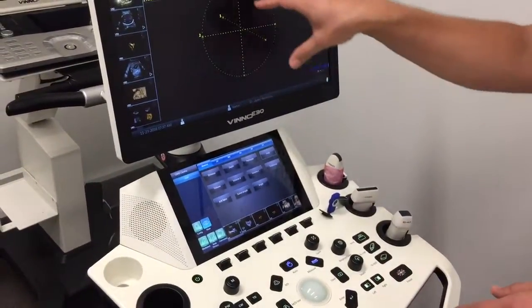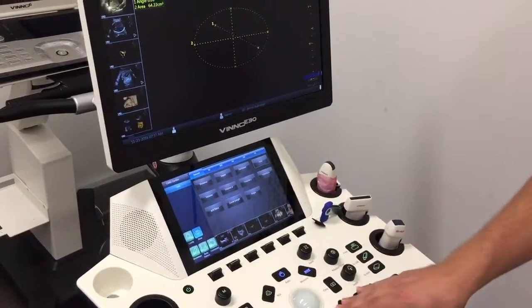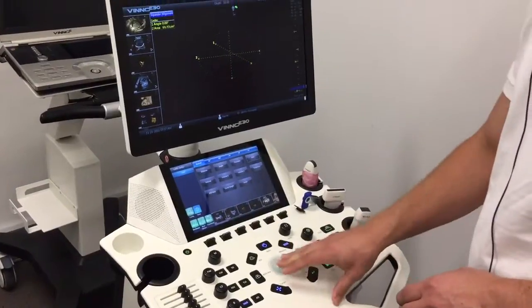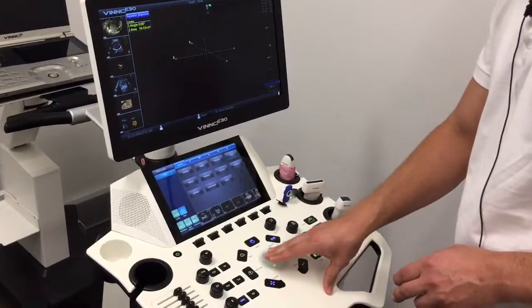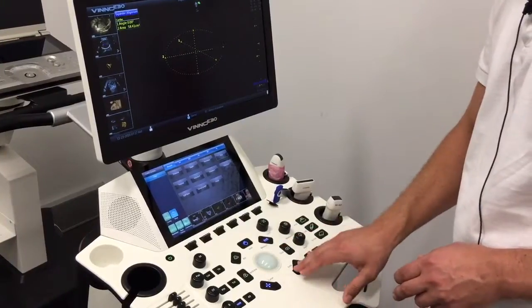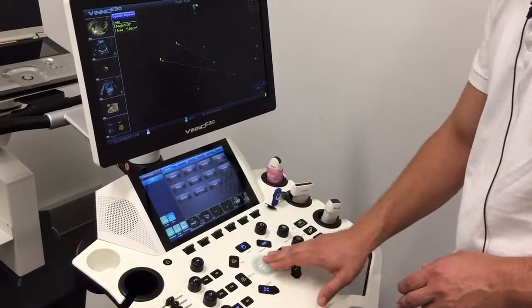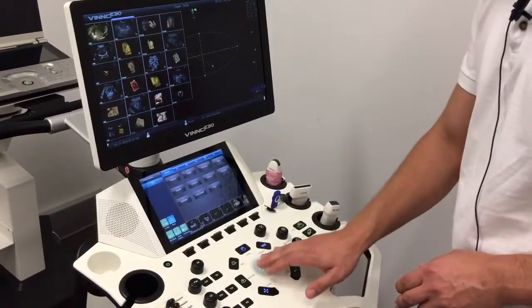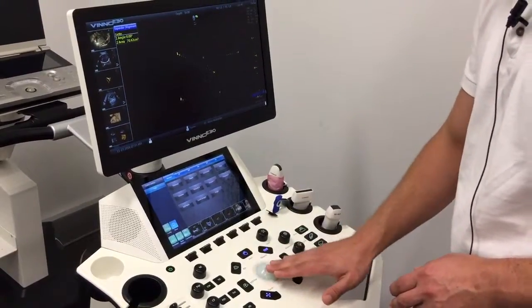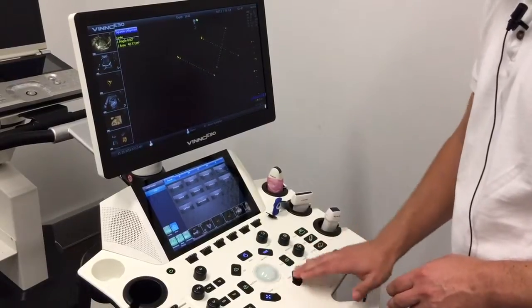For your ellipse, if you decide that you measure your ellipse here, for example, and then you want to move that ellipse around, it's doable by double clicking on the little crosshairs on each side of the ellipse. So you can spin around side to side if you've positioned it slightly off where you wanted it to go, which is often the case.